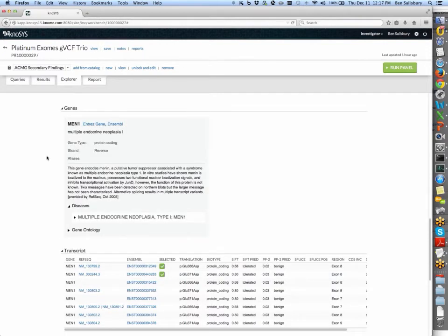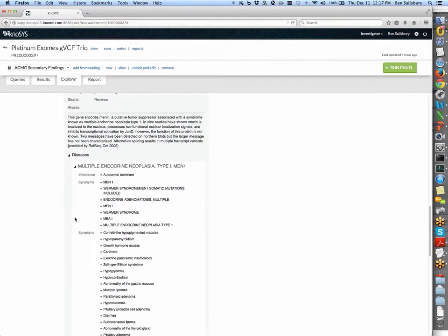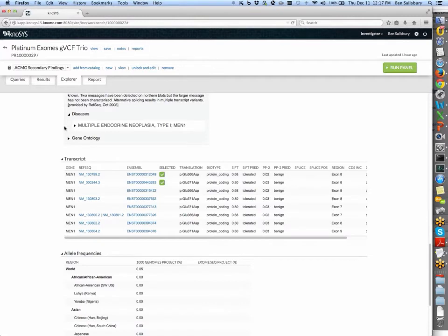But scrolling down a bit further, we can review this gene. When you're studying an exome, this is particularly handy, as few people are expert in all 20,000 plus human genes. And if we want, we can also open this up and read quite a lot of information about that disease phenotype and symptoms, synonyms, and the inheritance pattern, coming from sources such as OMIM, Orphanet, and Decipher via the Human Phenotype Ontology.